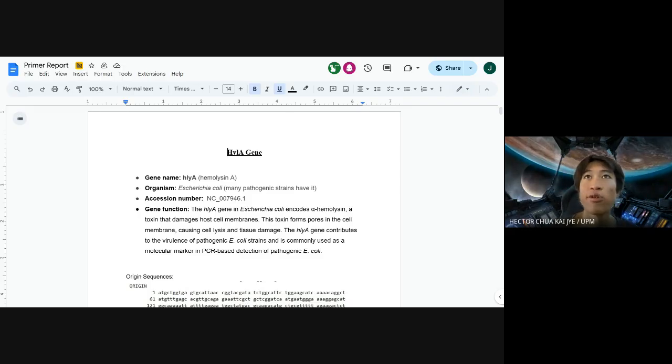So today we'll be discussing the primer design work. Basically, what we've done is we picked E. coli as our organism, and the software that we use, I've tried Primer 3 Plus, but mainly I will use NCBI as it has databases already implemented in the software, and of course it is very fast and I would say very accurate as it makes 10 pairs of primers at the same time, both forward and reverse.